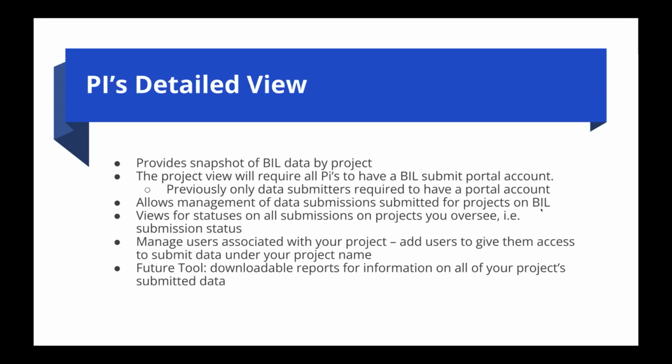Essentially, you can just manage things and see where everything is. There is also the ability to create more projects and add people on your team to those, so they have another tag to submit data to. We're looking to a future tool as well for a downloadable report with all this info of your project, so you can pull that down as an Excel, CSV, or tab delimited style file and have that available to you.